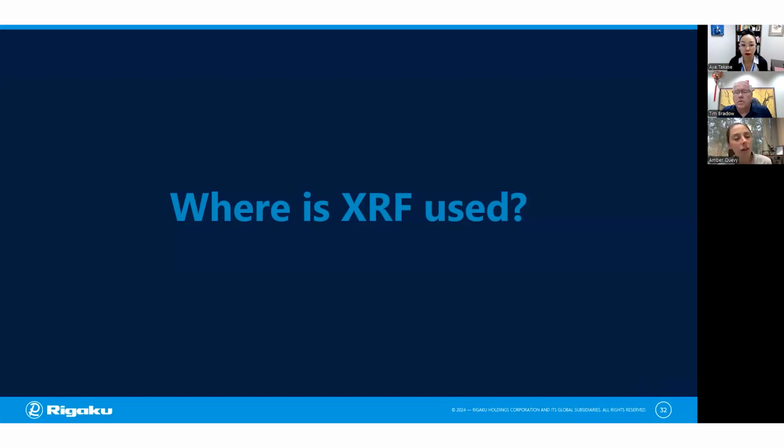So in the case of going from ICP to XRF, the pass-fail threshold is going to depend on what elements you're looking at and what concentration range. So in the case of, if you're talking ppb, parts per billion detection range, something like that, that's not for XRF. That's going to be ICP. I wouldn't switch to XRF for that. But in the case that you're looking at ppm or mass percent, we can calibrate the instrument with very good precision. I don't think that you would have to worry about adjusting any thresholds in that case.